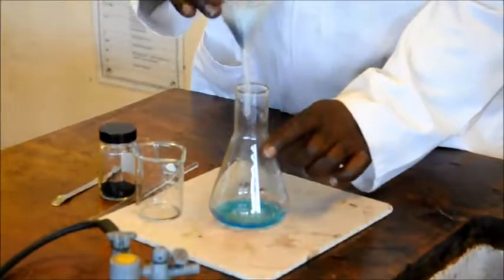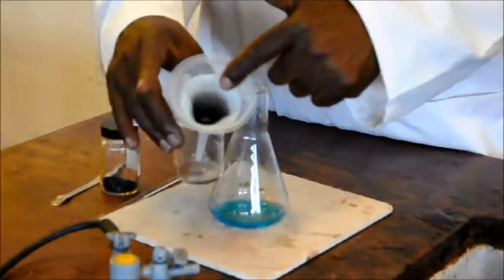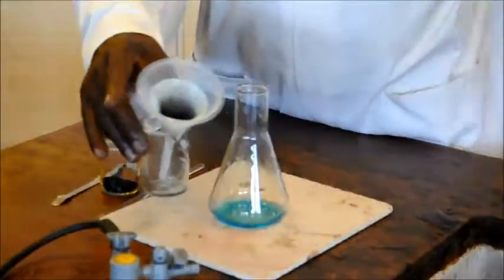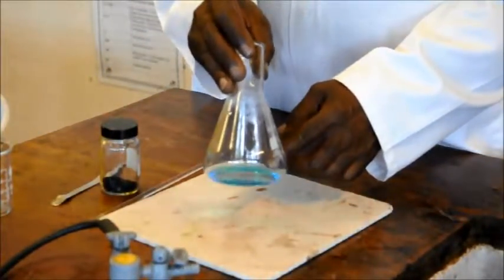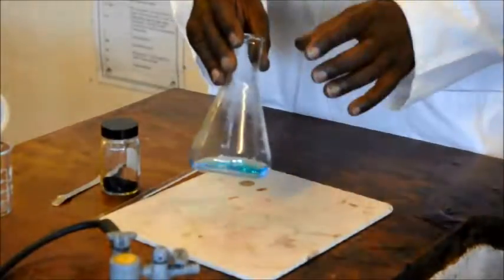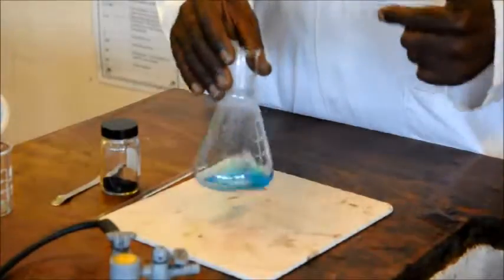So I take the funnel away. I don't need the unreacted copper oxide, so I can discard the filter paper. And this is what I'm interested in, the blue copper sulfate solution. The next part is to separate the copper sulfate from the water, or in fact we'll separate the water away from the copper sulfate.